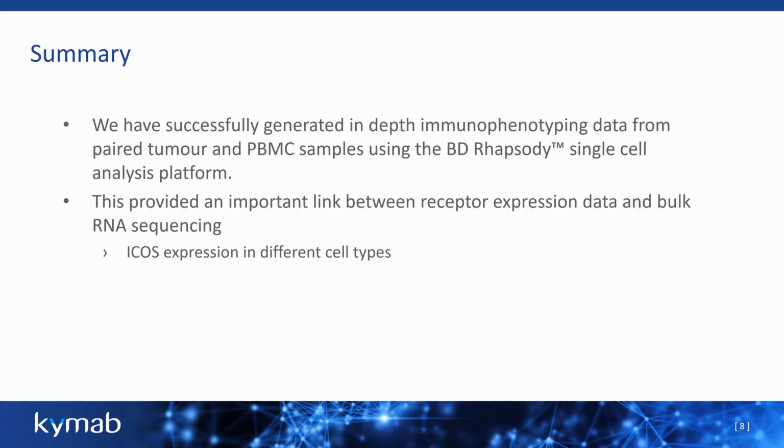So, in summary, we've basically successfully used the BD Rhapsody platform for in-depth immunophenotyping of cancer patient samples.